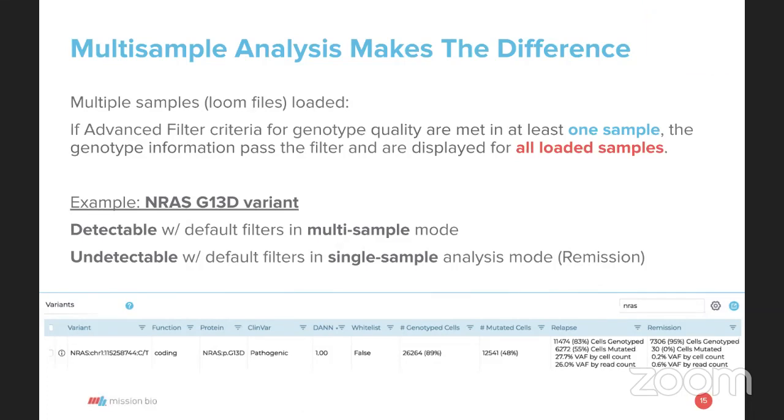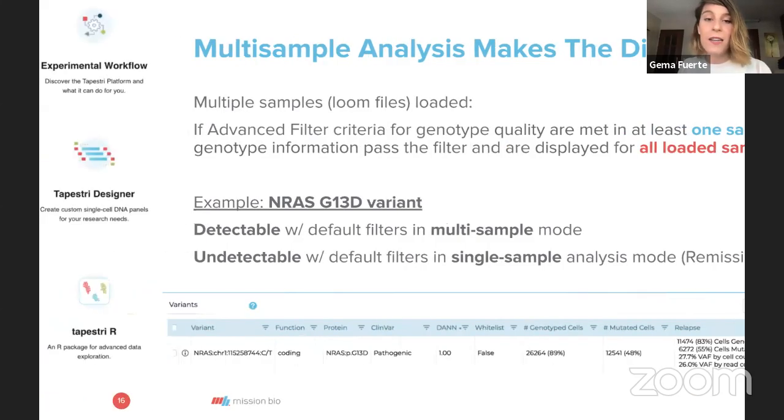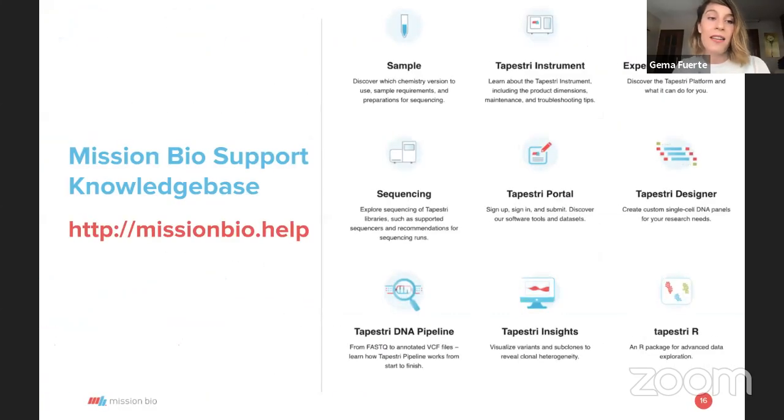Awesome. So that was all from me on advanced filtering. Just to remind you that we have a very good knowledge base. We actually have an article on this advanced filtering. It has like 11 pages with all links to this haplotype caller and GATK and all these useful websites, as well as information on sample and general analysis. And that's the website over there. So with that, excellent. Thank you very much for your attention, and let's see if you have questions.